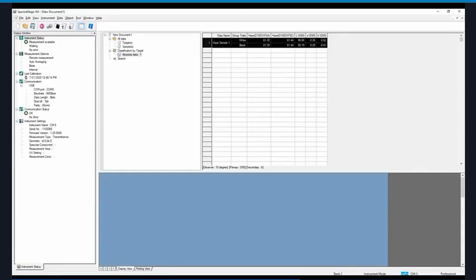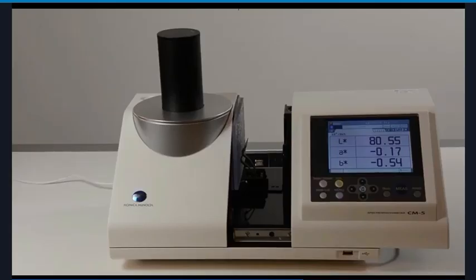Now you might be thinking this is quite a bit of button clicking to get a single measurement. I have good news for you though. We only have to measure the target backing material once for the trial, as the data will be stored and used for all subsequent haze measurements. This reduces the number of measurements to 2 for each sample. I will demonstrate this now.